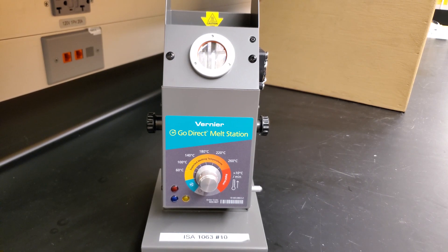Today we're going to be discussing a melting point apparatus. A melting point apparatus is used to accurately determine the melting temperature of solid substances.